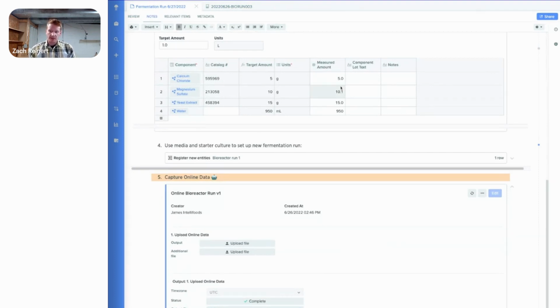So one of the common concerns we hear from our customers is how do we control who has access to certain projects? And while there are a number of ways to do that, we've recently simplified the process, saving IT administrators a lot of time. So what I'll show you next is how I can check in on a user and look at their permissions for a certain project. And for that project, instead of me having to tabulate all the different permissions based on who they are, Benchling just takes care of that for me and simplifies the whole process.